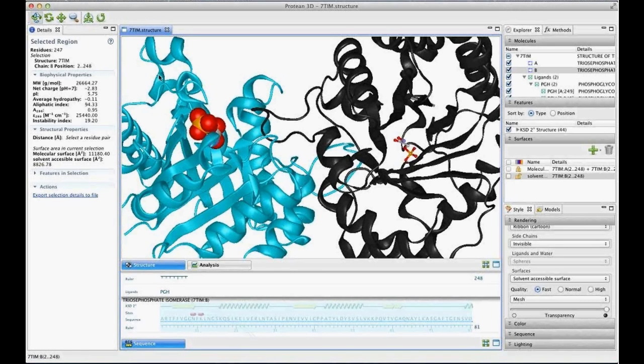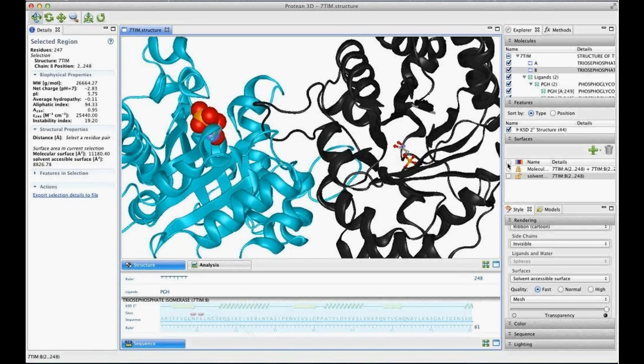Amanda, I think we have a few questions now, if this is a good time. One, you mentioned briefly the different quality of surfaces. What is the difference in those? Is the high quality a long computational time, or what would be the reasoning for using a different quality surface?